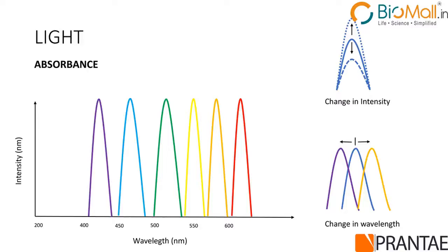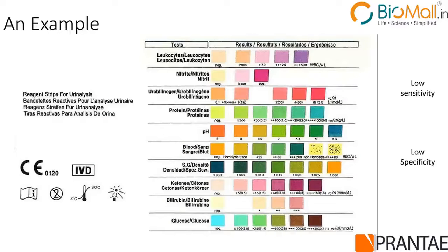Conversely, the intensity may not get affected, but the peak wavelength where the molecule absorbs may get affected due to the behavior or the sensing capability being done by the molecule. So these are the two essential behaviors that you can expect out of this system. Now, this has been very widely utilized in almost everything that biologists and chemists do for measurement, one of the most fundamental.